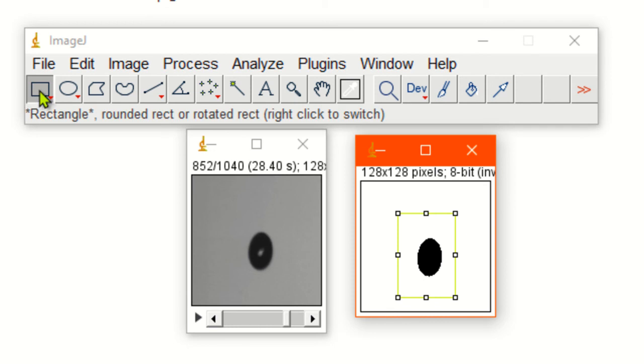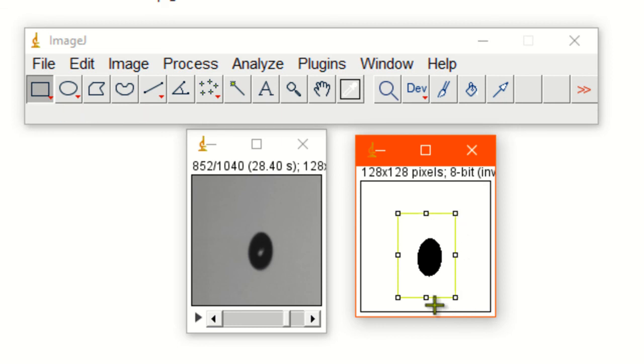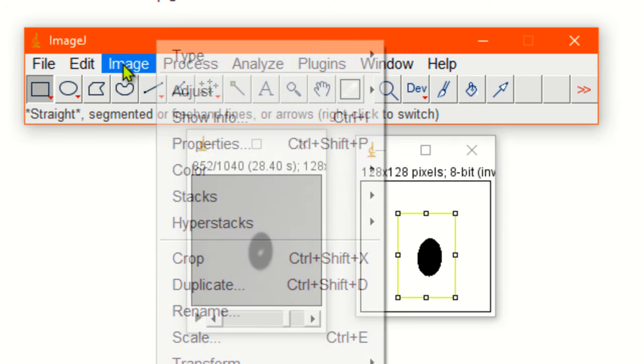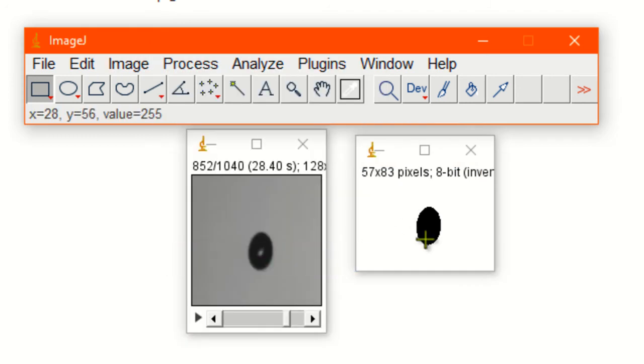Select rectangle selection. Let's keep the image in the rectangular section, and then go to image and simply press crop. Now you can see it's cropped.